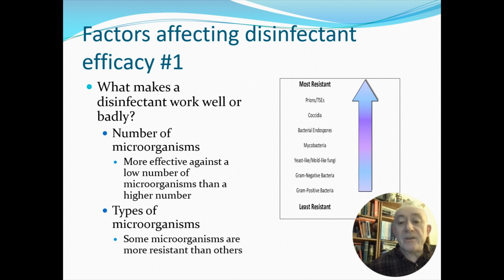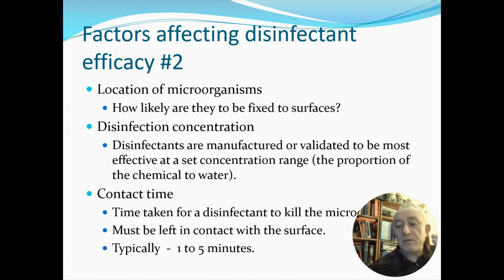We also need to consider the location of microorganisms, so how tightly they're bound to surfaces, the concentration of the disinfectant and how optimal that is against the validated state. So we've got the risks of over or under diluting, or the loss of activity over time. So particularly if we're using a bucket method, after a period of time that activity is going to fade away. We also need to acknowledge that the contact time is also really important. So that's the time taken for the disinfectant to kill microorganisms. And importantly, it's the length of time that it needs to be in contact with the microbial cell. So it's really important to keep surfaces wet to allow that to happen.